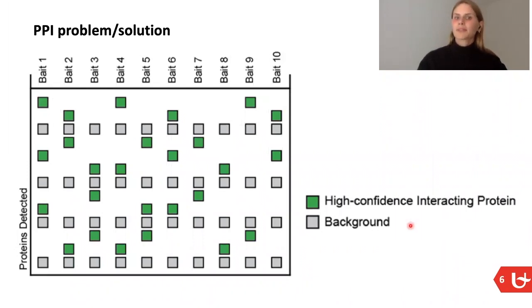In most of the protein interaction filters, they start from the assumption that the background is constant across runs and that an interacting protein can be found by looking for proteins whose abundance is above their abundance across many runs of unrelated baits.